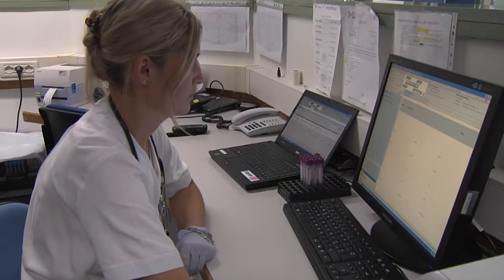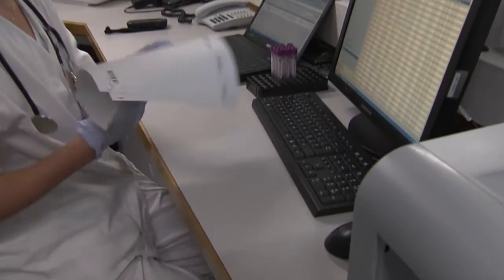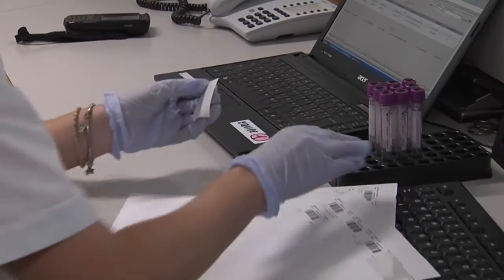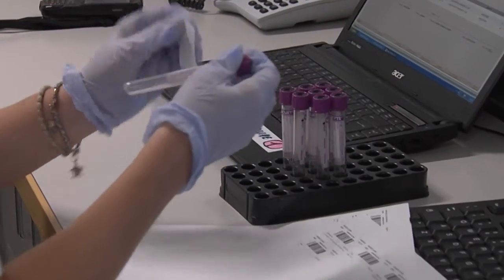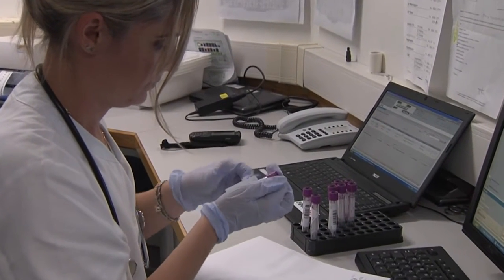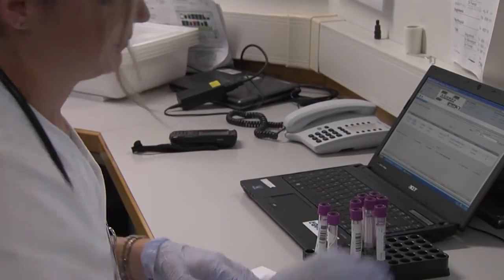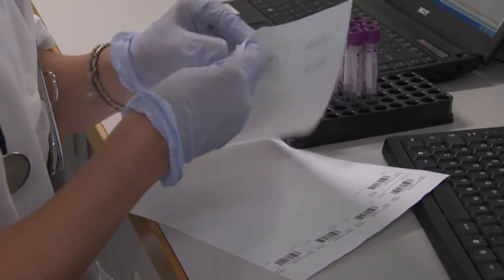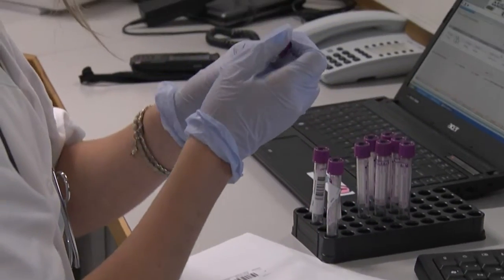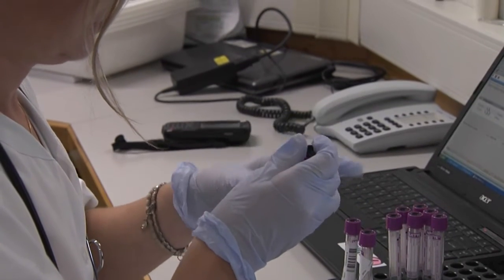It has been fully demonstrated by the literature that currently errors in the diagnostic process occur mostly in the pre-analytical phase, up to 60% of cases, and that the most frequent error in around half of cases can be attributed to an incorrect identification of the primary sample, that is, erroneous labeling. Errors of labeling leading to the wrong test tube or the wrong patient can compromise the quality in the production of laboratory data at source, with no possibility of remedying the mistake in the subsequent process phases.